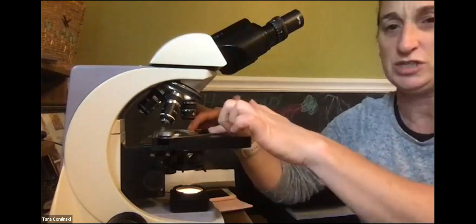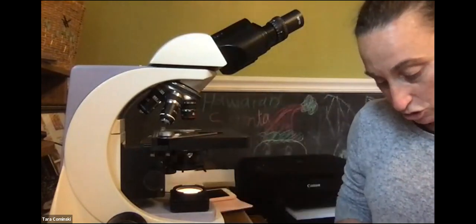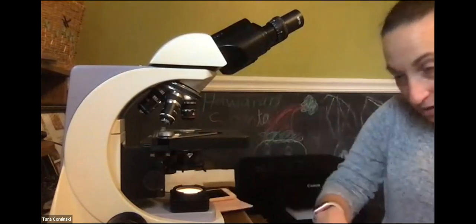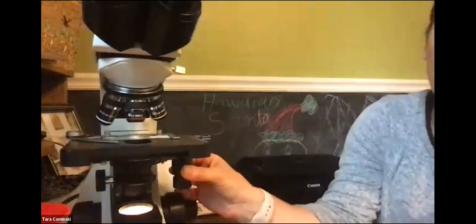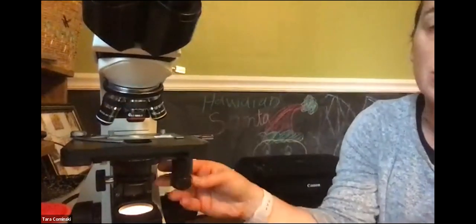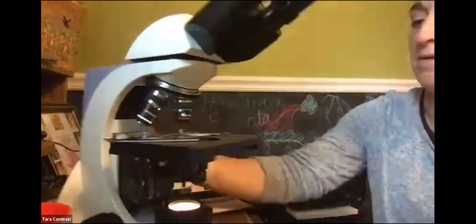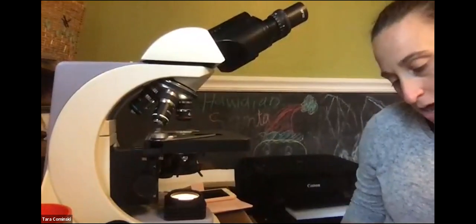There are different versions of this, but it basically holds that slide in place. Mechanical stage control knobs, you can kind of see them, I'll turn it. Those are here, right? You can see it moves the stage or the slide side to side and front and back, okay? So you should be able to label those on your diagram.